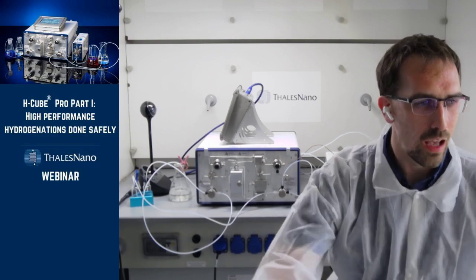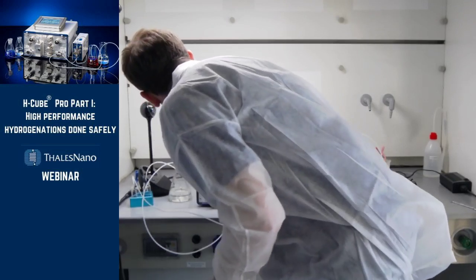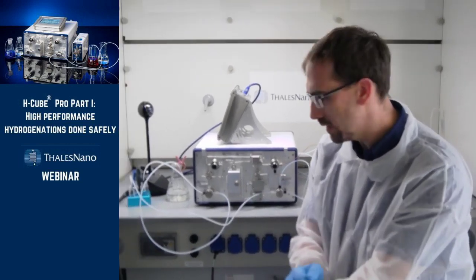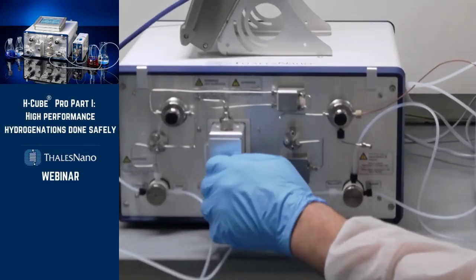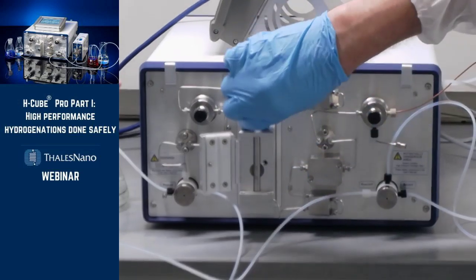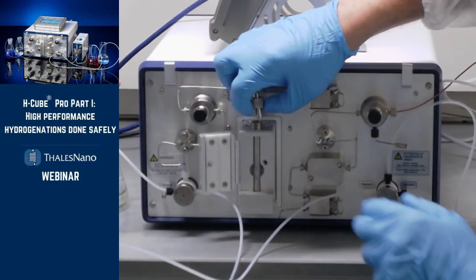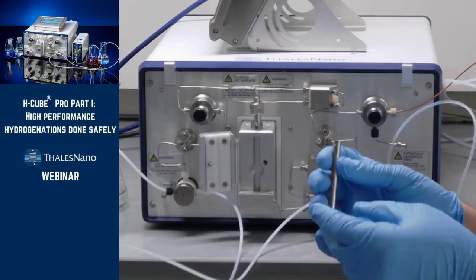Can we see a cartridge? Yes, you can. So let me just take a look. Yeah, the temperature is 56 degrees. I can handle that. So here we have a little screw which closes the door. And now here we have a 70 millimeter long cartridge. This screw up here is finger tight, so I can just use my finger to untighten it, and then I am able to remove the cartridge.